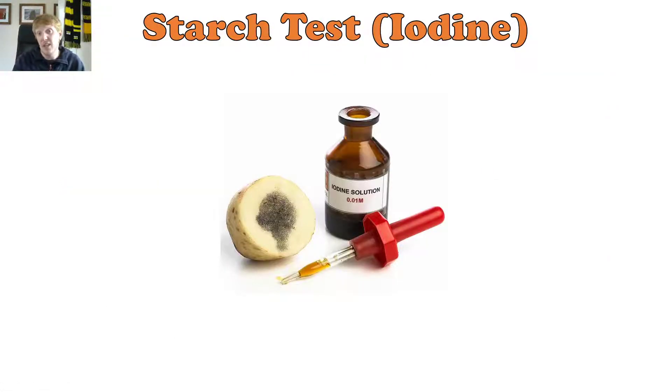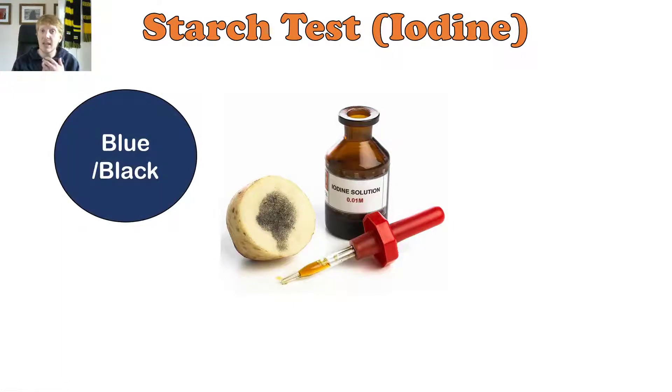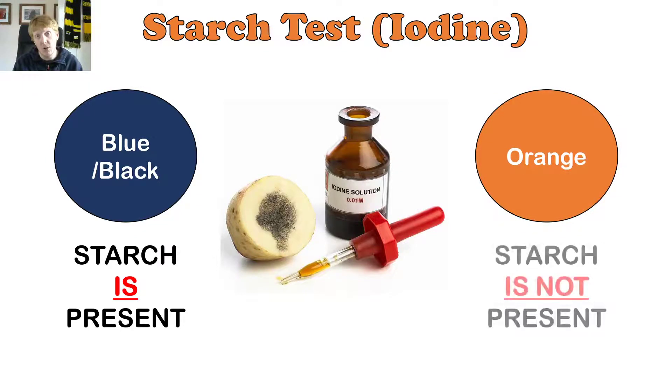Next, to test for starch, we use this solution here, which is our iodine solution. And if starch is present, it will go a blue-black colour, a really dark blue. So if it's blue-black, starch is present. If it stays orange, which is the colour of iodine, it means starch is not present.